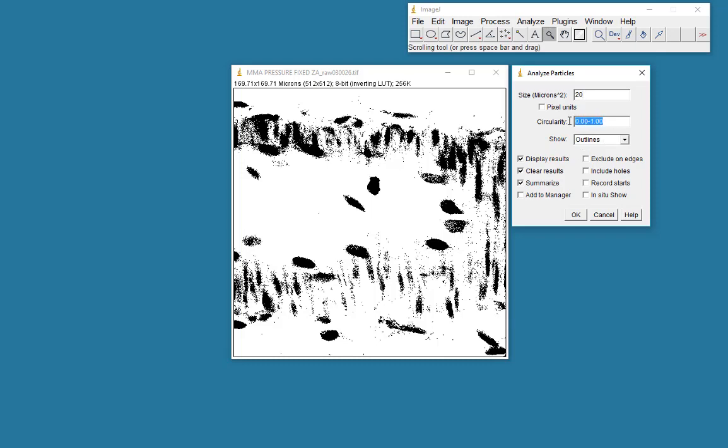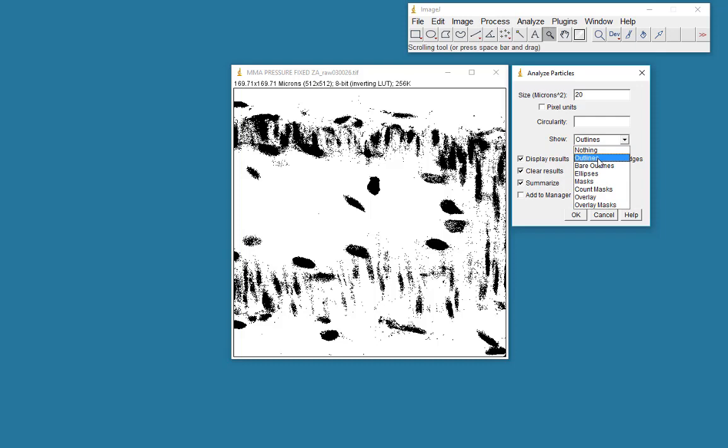I don't want to confine my measurements to objects of a particular circularity. So I'll just clear that. And in my results, I would like to see the outlines of the objects which are selected. And I'll click OK.